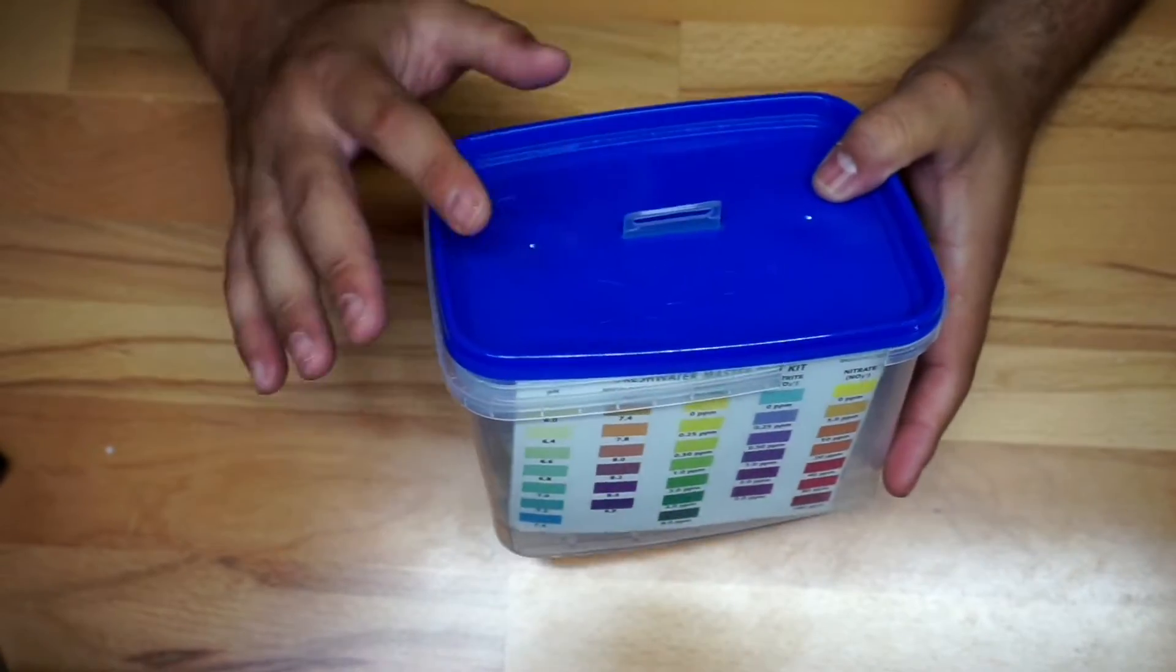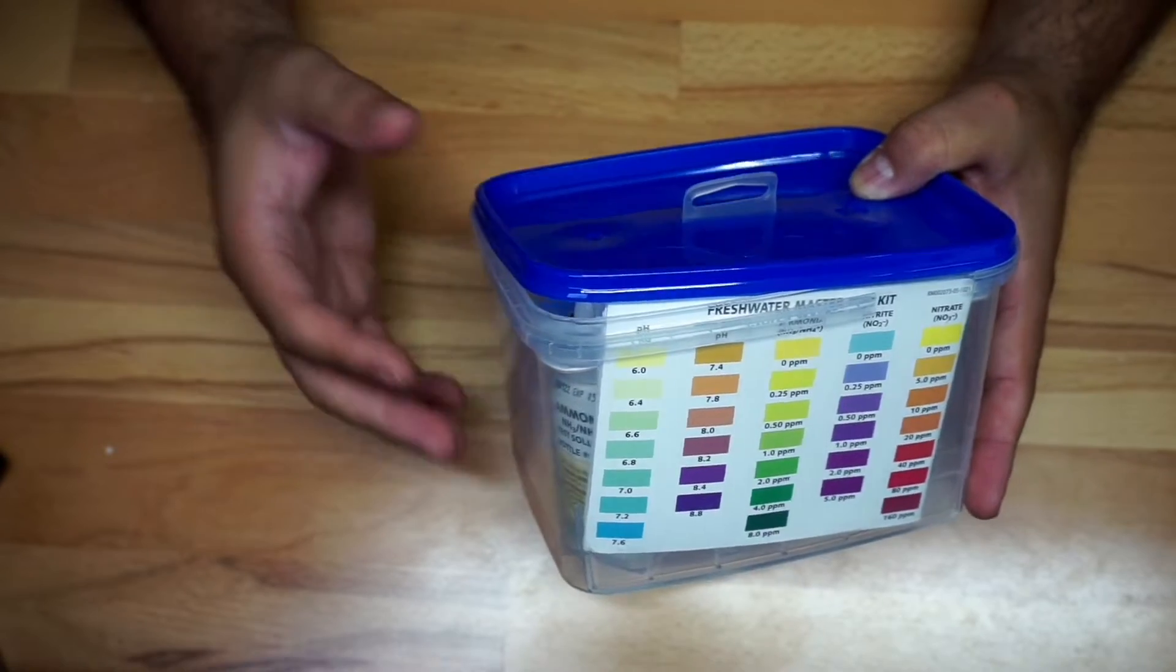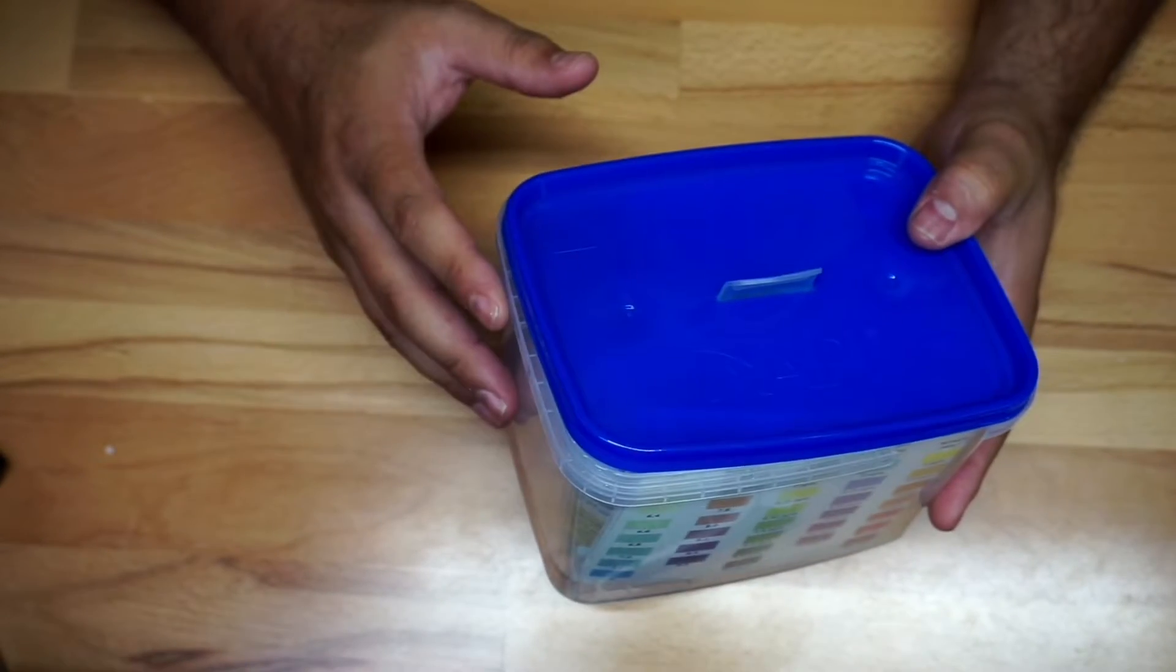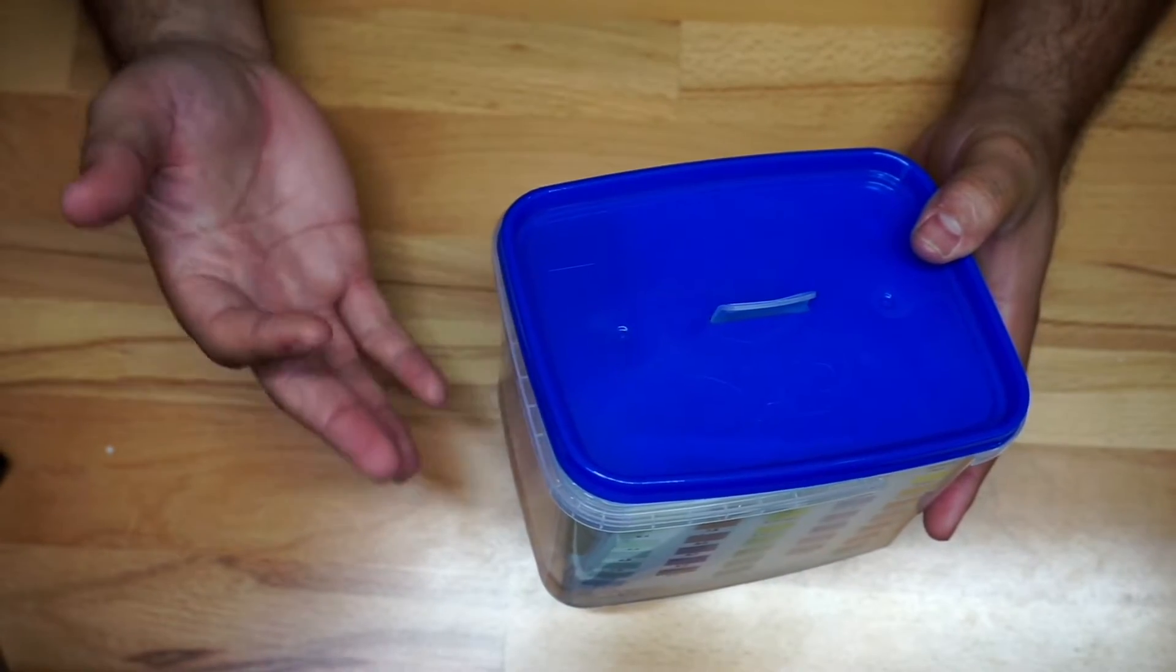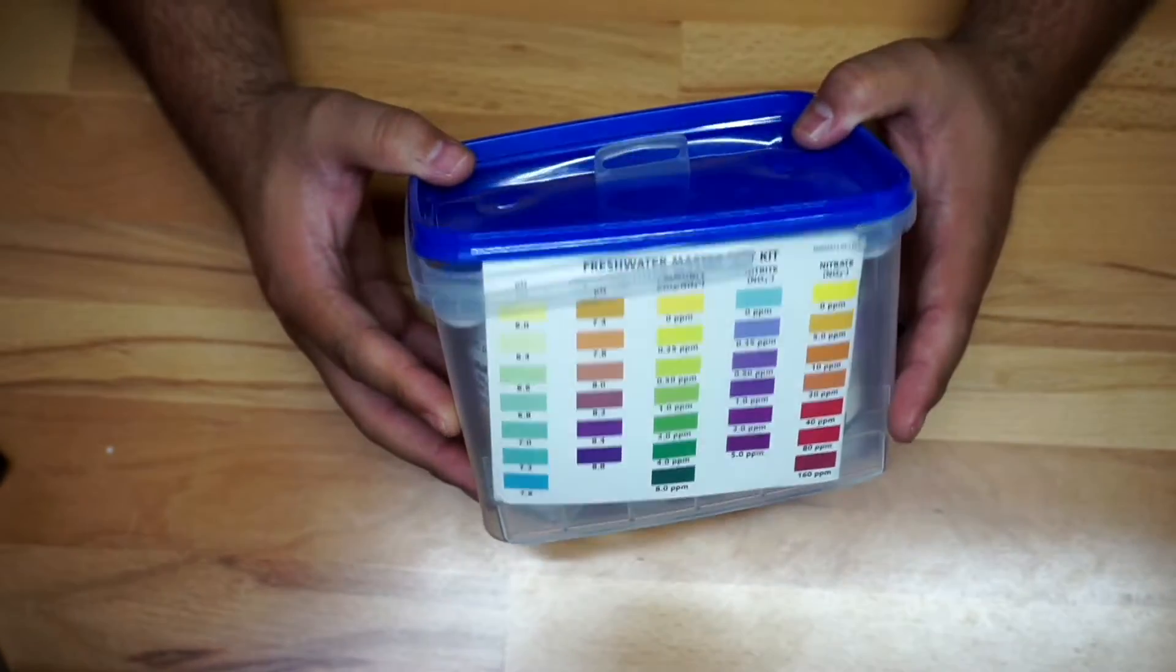Okay, so if you have an aquarium this is definitely something that you need to have because this is going to allow you to test the water. They sell it for freshwater, rift, as well as saltwater. It's really not that expensive and you do get a lot of capabilities out of this.